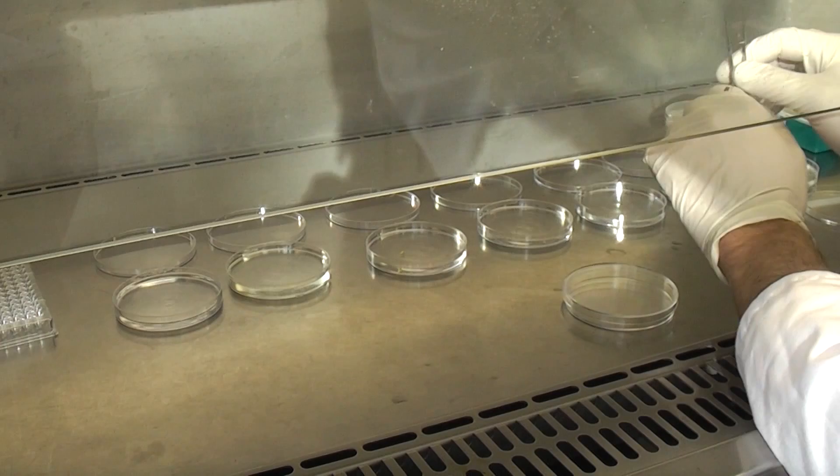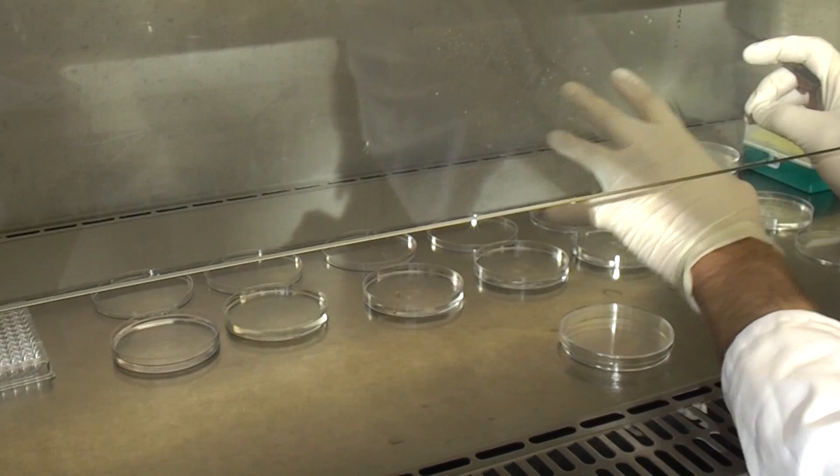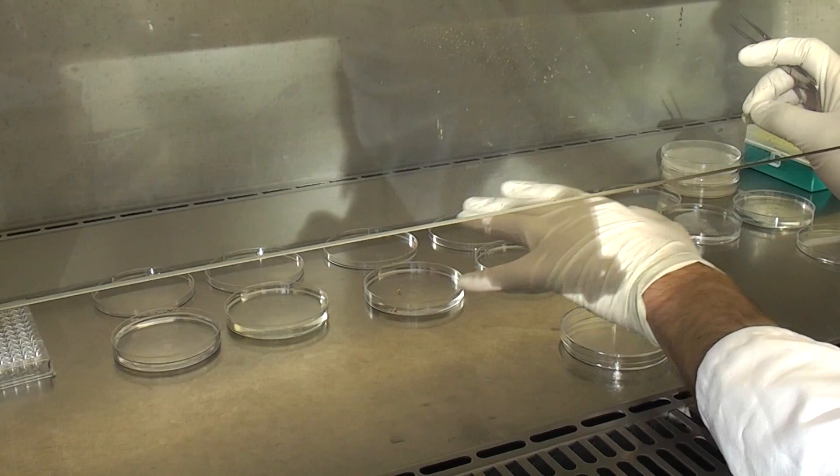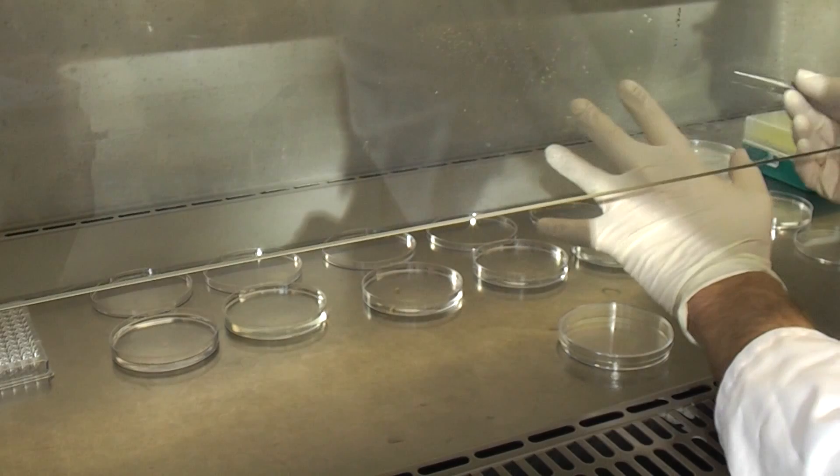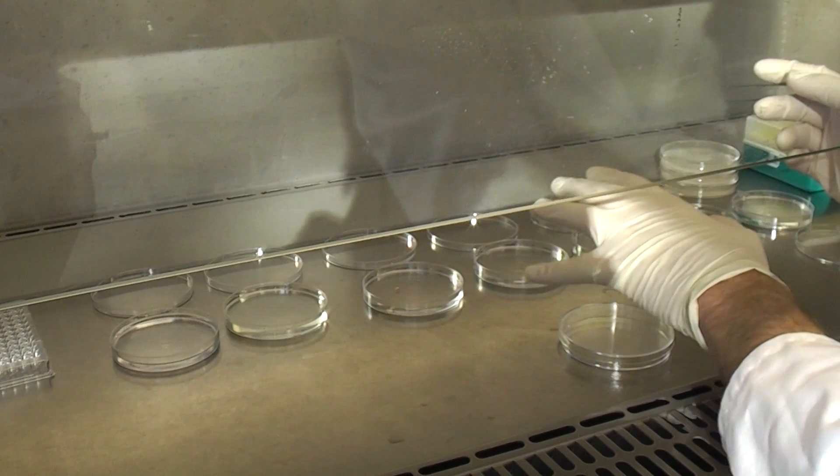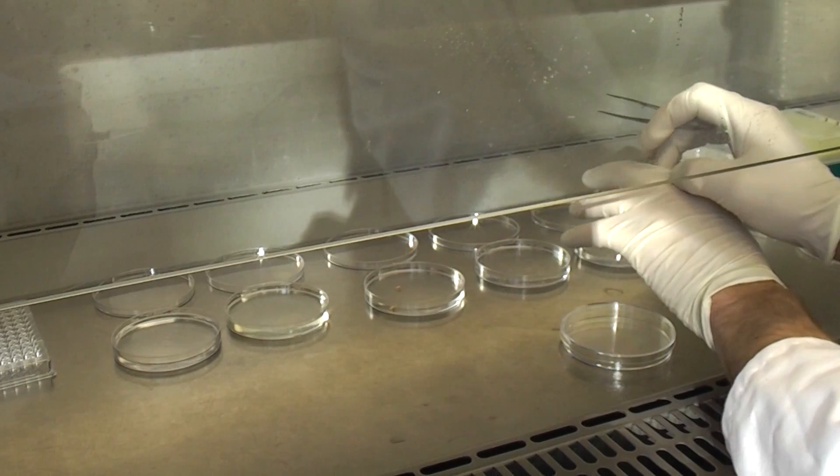And now what I've done is we use those strains that we isolated from that initial trial and we have grown them up in a culture and re-inoculated plants in our glasshouse with them. So by doing that what we were able to see is if any of the strains produce an increase in plant growth which would generally be from improved efficiency of the symbiotic relationship between the plant and the rhizobia. So what the rhizobia wants is it wants some carbon or glucose to keep it moving along. So that's what keeps it alive. And in exchange it gives the plant essentially fixes nitrogen from the atmosphere for the plant to use.